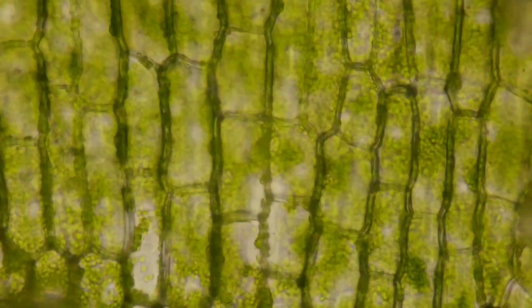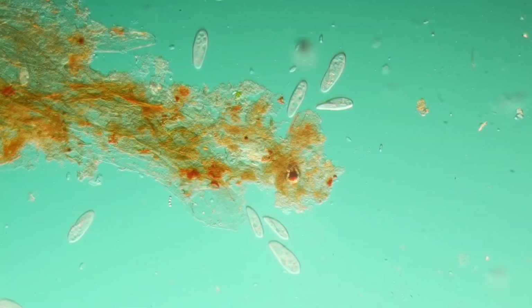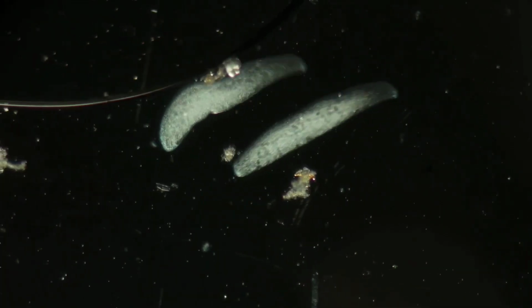So today we will see how chloroplasts look inside plants. We will see the ancient ant in amber and figure out what microorganisms live in an ordinary aquarium with Udaman and Pumba. Let's go.